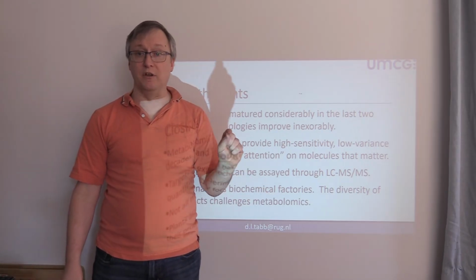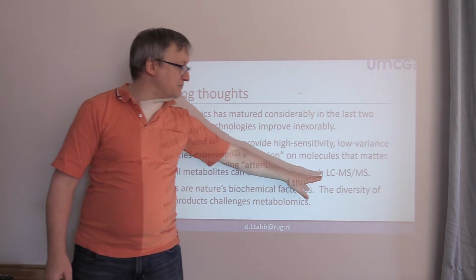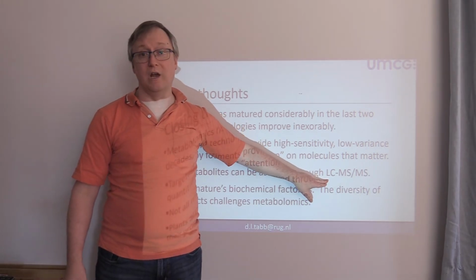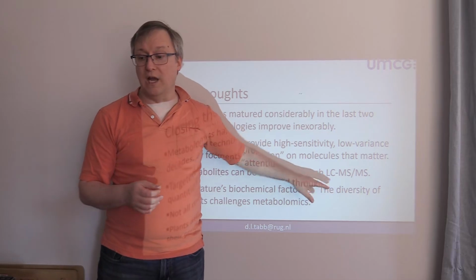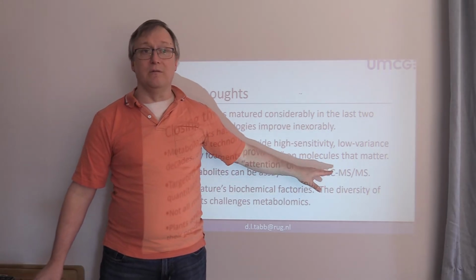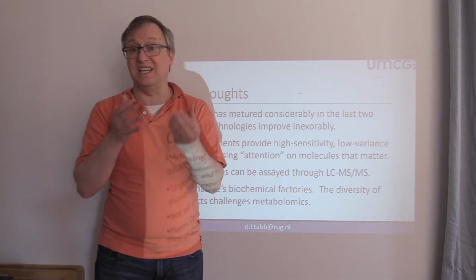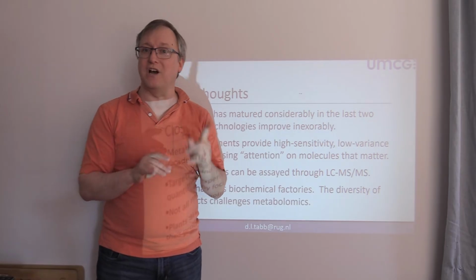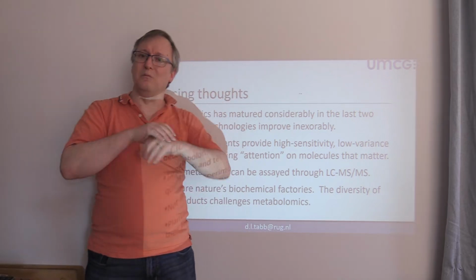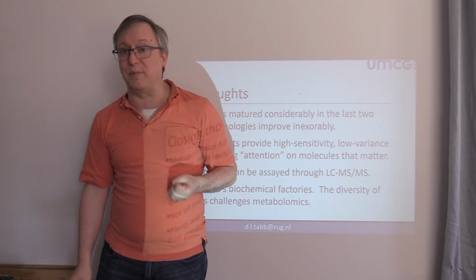Use a targeted experiment when just a handful of the metabolites are what really matter to you. Yes, maybe your laboratory has access just to an LC-MS-MS, but someone near you has GC-MS available, someone near you has a triple quad. There are lots of instruments out there that can support you. There are lots of people out there with special expertise in separation technologies like CE that should also be part of your mix. And you should not say, well, we're a mass spec lab, we don't think about NMR at all. NMR has a lot to show us. So being ecumenical about which technology is going to give you the best answer is going to give you the best biological punch, I think.